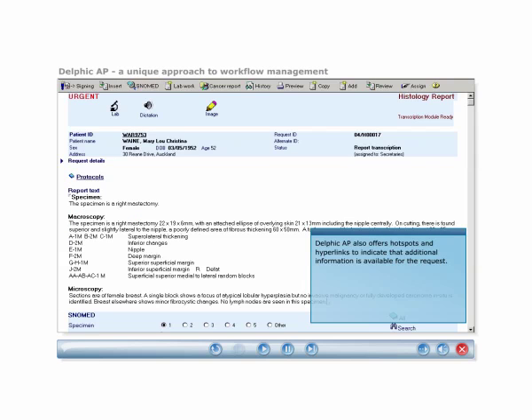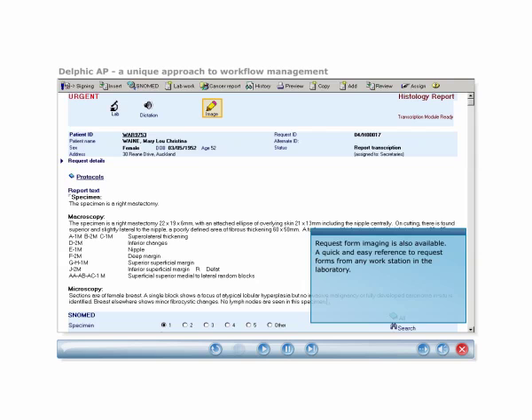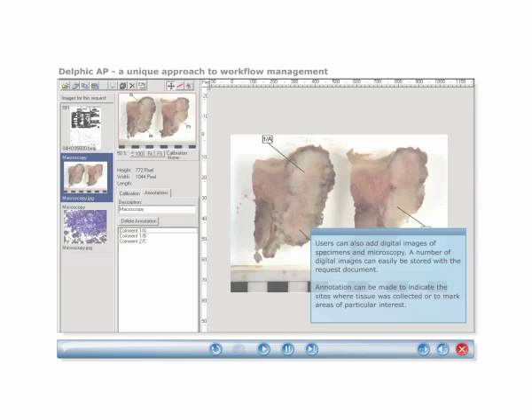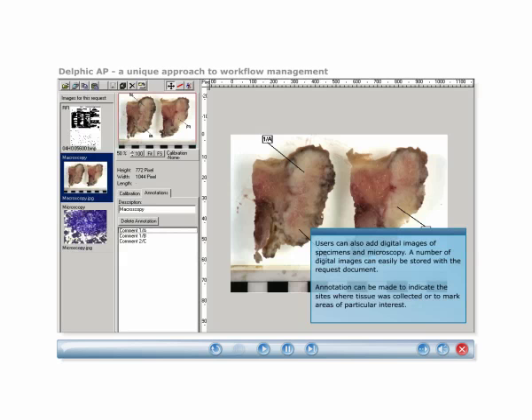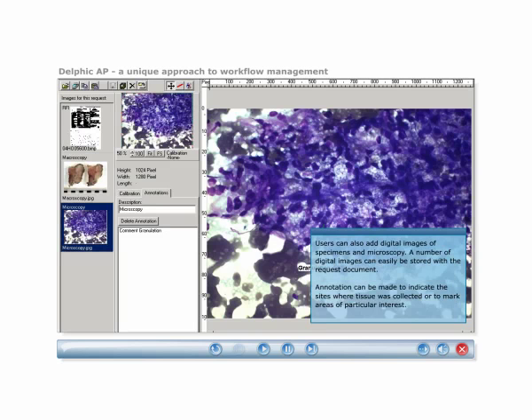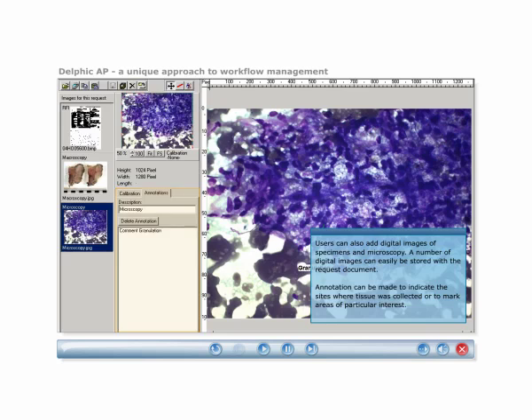Delphic AP also offers hotspots and hyperlinks to indicate that additional information is available for the request. Request form imaging allows an electronic copy of all request forms to be stored on file with the request document, providing quick and easy reference from any workstation in the laboratory. Users can also add digital images of specimens and microscopy, which can be stored with the request document. Annotations can be made to indicate the site where tissue was collected or to mark areas of particular interest.